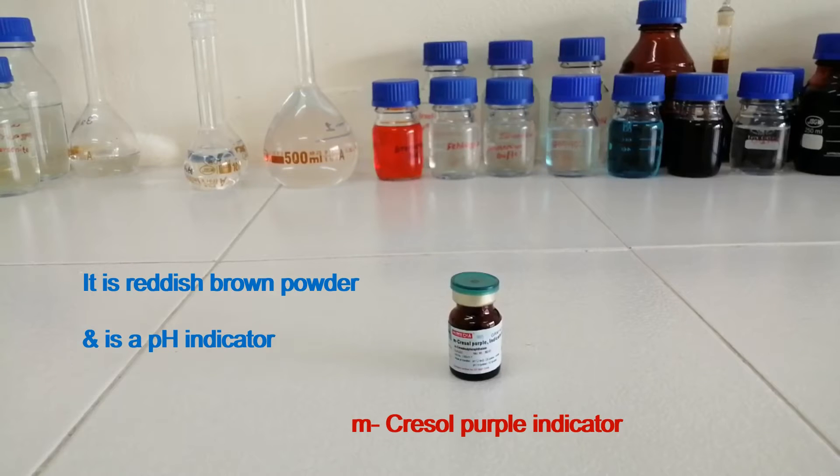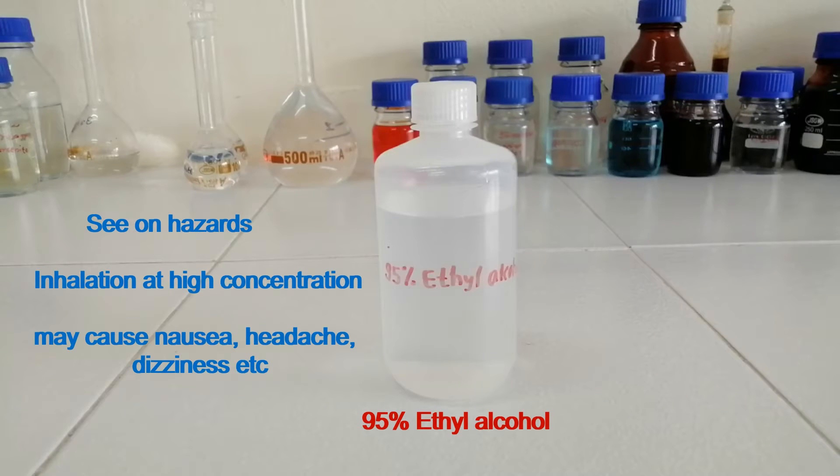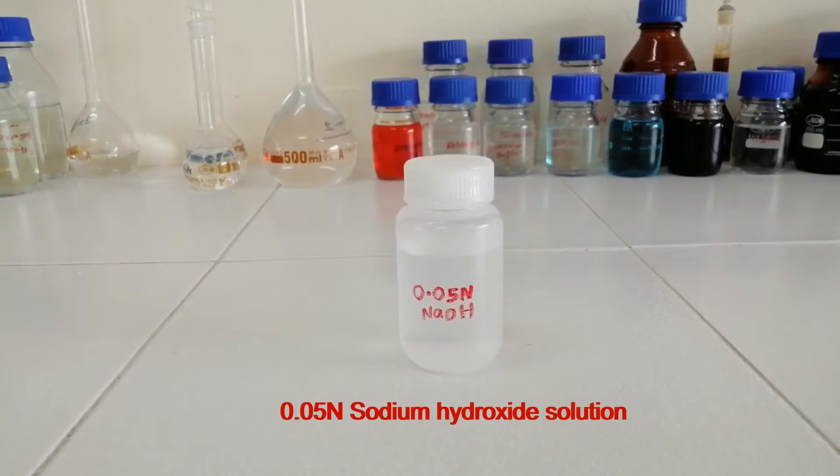This is metacresol purple indicator. It is a reddish brown powder and is a pH indicator. This is 95% ethyl alcohol — see the hazards: inhalation at high concentration may cause nausea, headache, dizziness, etc. This is 0.05 N sodium hydroxide solution.